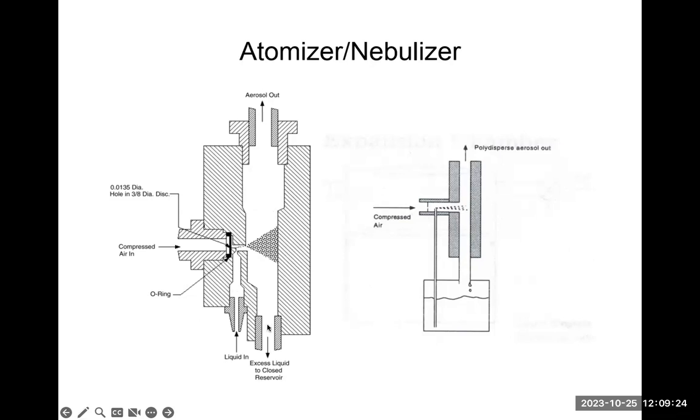For example, for the nebulizer mechanism here, it's actually using the metal block as a surface for the liquid impingement. So once the liquid is impinged onto the solid surface, it's going to generate tiny droplets. The larger droplets will just settle down by gravitation, and then the smaller droplets will get carried by the gas stream and then further get introduced.